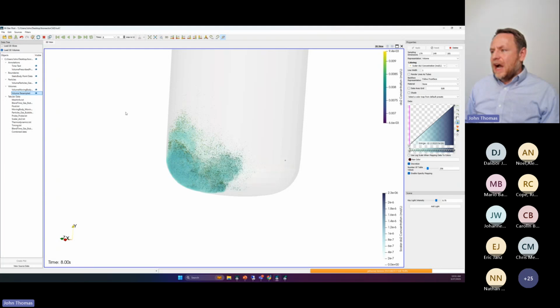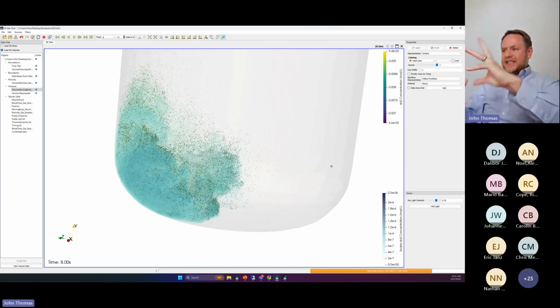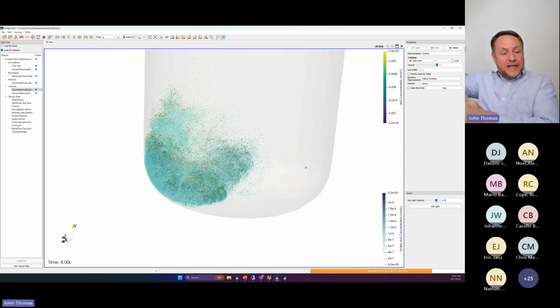My volume, I can see oxygen moving through the system, following the bubbles, as it were, because the bubbles are what's causing the oxygen to exist in the aqueous phase. It's kind of neat to see that oxygen plume following the bubbles as they emerge throughout the vessel and watch this guy buzz. Okay, this will eventually converge towards a saturated state, right? Eventually, the bubbles keep pushing oxygen in until the oxygen concentration in the dissolved gas matches the saturation limit and there's no more oxygen transfer.